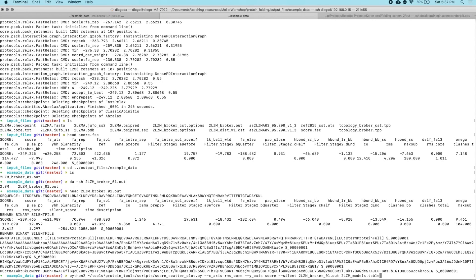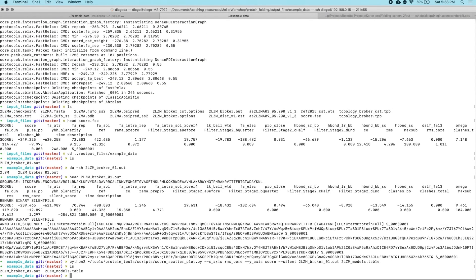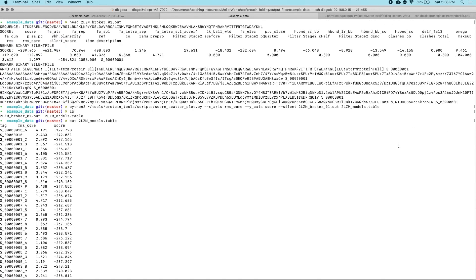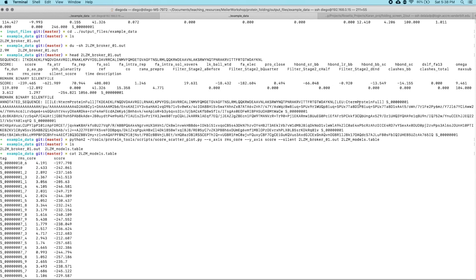I've written out the command to just isolate the two variables that we're interested in, which is the RMSD of the secondary structural elements — the residues in helices — as well as the total score of the models in this file. Go ahead and hit enter, run an ls again, and you'll see that there's now a file called 2lzmmodels.table. We can take a look at what that file looks like, and you can see that we've stripped away all of the structural information and all of the score information we weren't interested in. So here we have the unique identifier for each structure, the RMSD for the core residues — the secondary structural residues — and then we have the total score.